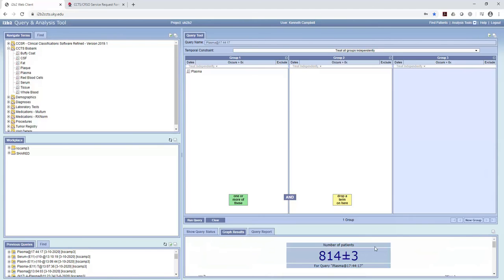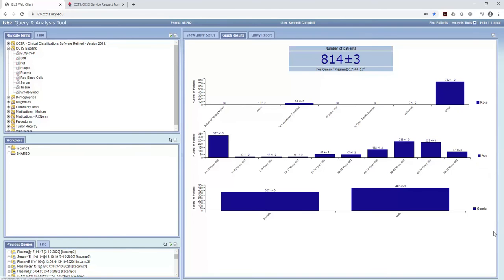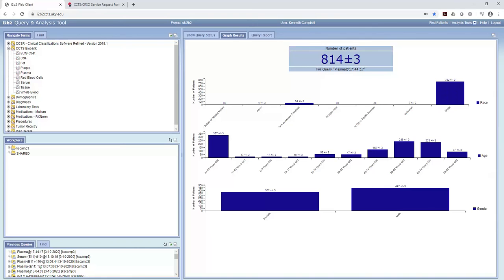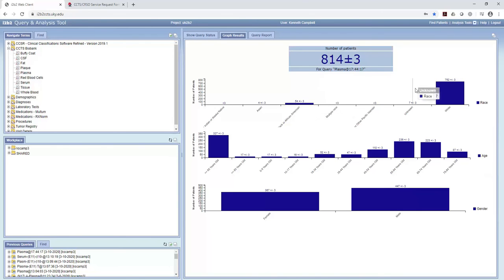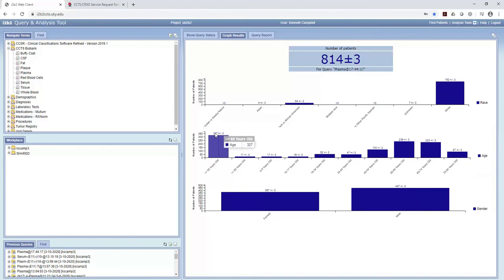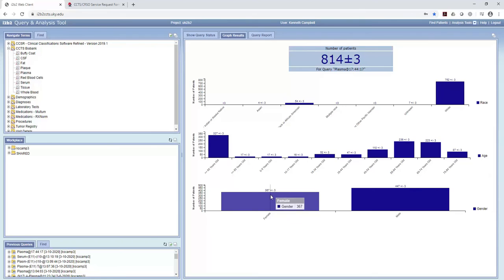So here we go. Here's 29.5. And there's a little icon here. And if I click on that, you can see we've got 814 patients that we as a biospecimen core have plasma from. 54 of them are black or African American, 752 are white. Here's the age breakdown. So 327 are more than 65 years old. 367 of them are female.